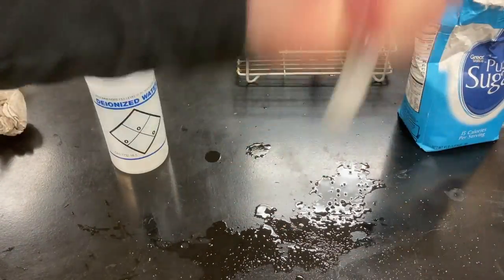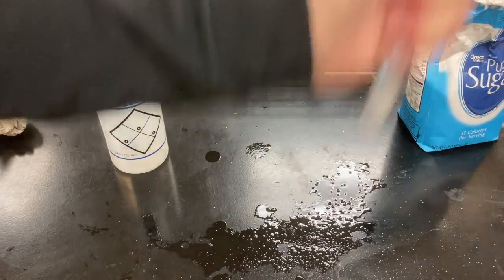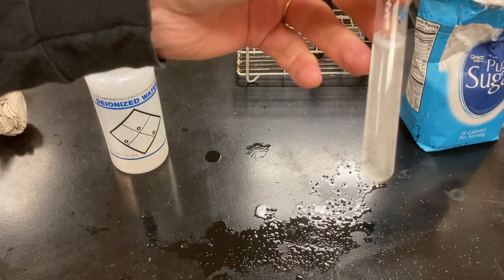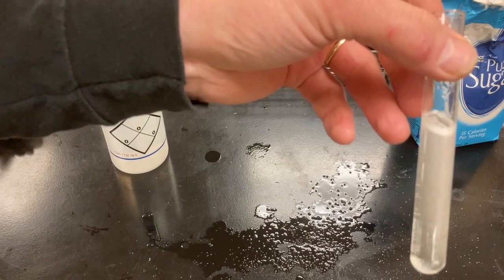Take a spoonful of sugar and put this in my test tube to create a mixture. I'm shaking this up now to mix it. I'm going to speed this up. I shake it for quite a long time here. You don't have to watch all the shaking at regular speed. When it's all done, you can see that there actually seems to be more like just one layer now. The sugar seems to have disappeared.